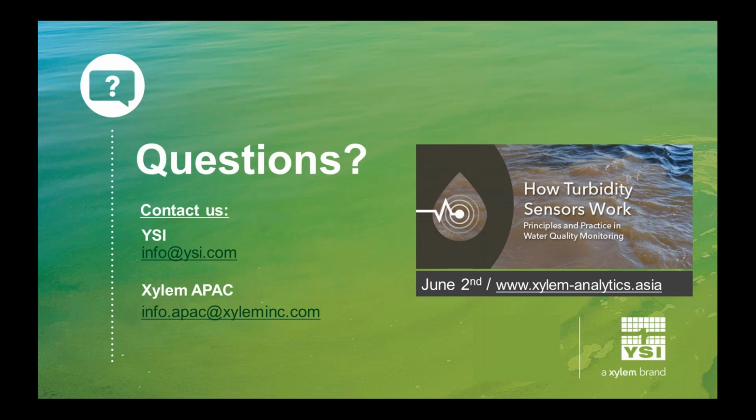Now, in closed pond monitoring, we do have people using algae sensors, and it depends on where those ponds are and how they're being managed and the type of algae that people are concerned about. So the short answer, which I should have delivered first, is that yes, the sensors definitely have application for the aquaculture industry, and we do have people using these sensors in multiple aquaculture applications today, Michael.